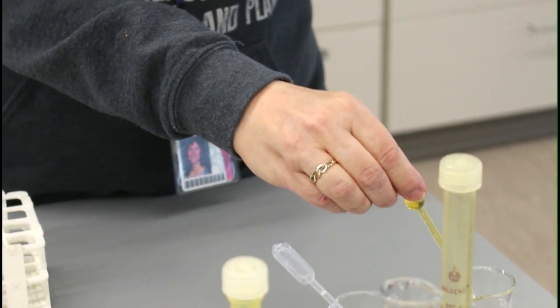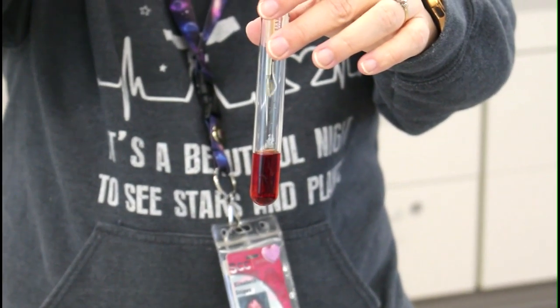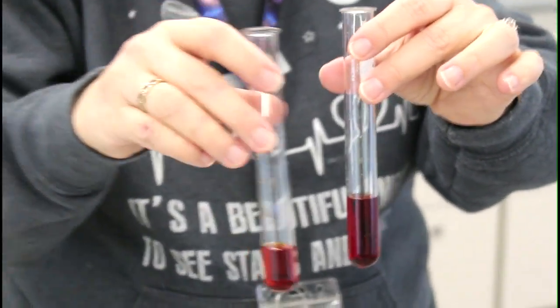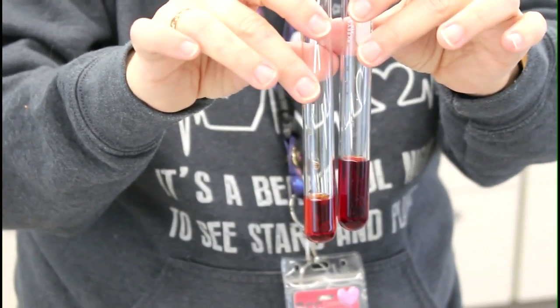Let's go ahead and give it a 1 ml shot. See what we got. See if we see a color change. Oh, I was going to say subtle, but I don't know. What happened? I'm going to go ahead and compare. This has been stressed with iron 3, and this is our control. So yeah, what are your observations for those two?